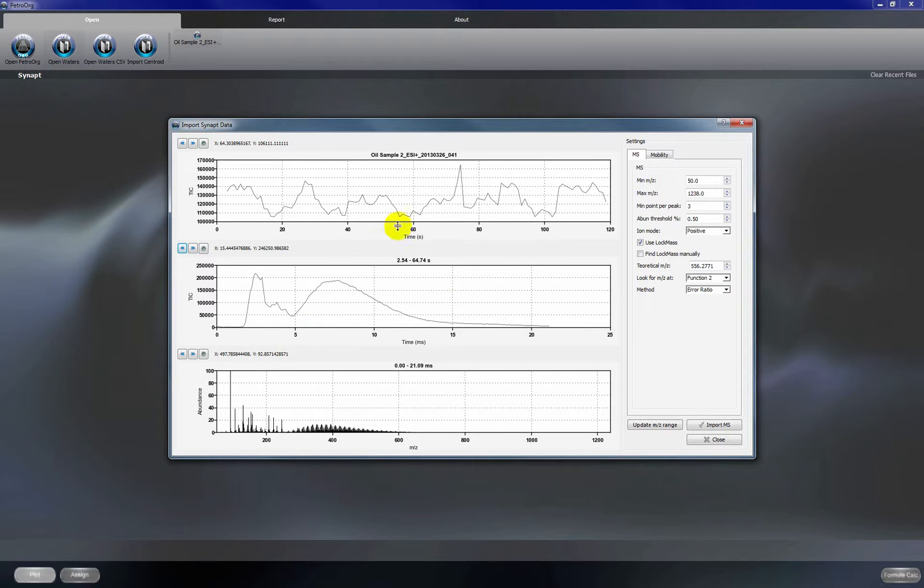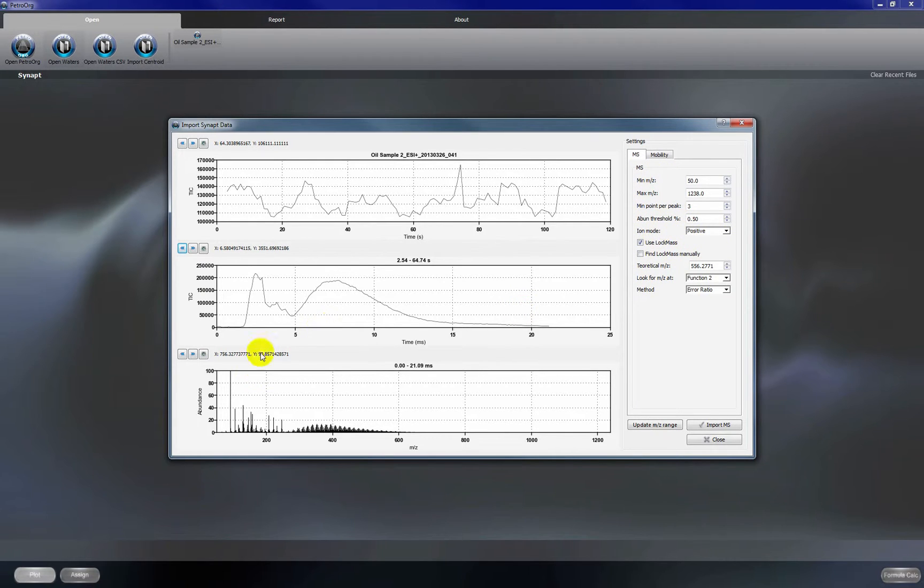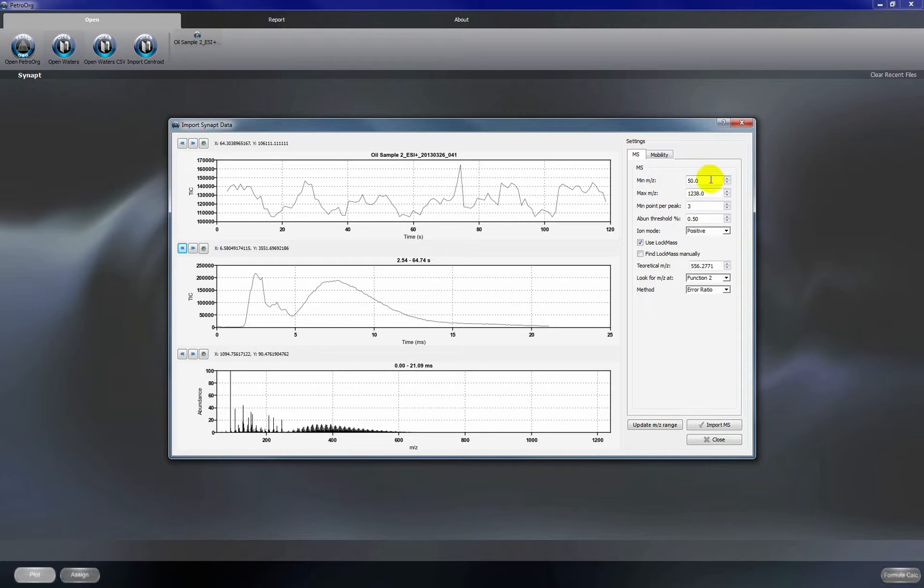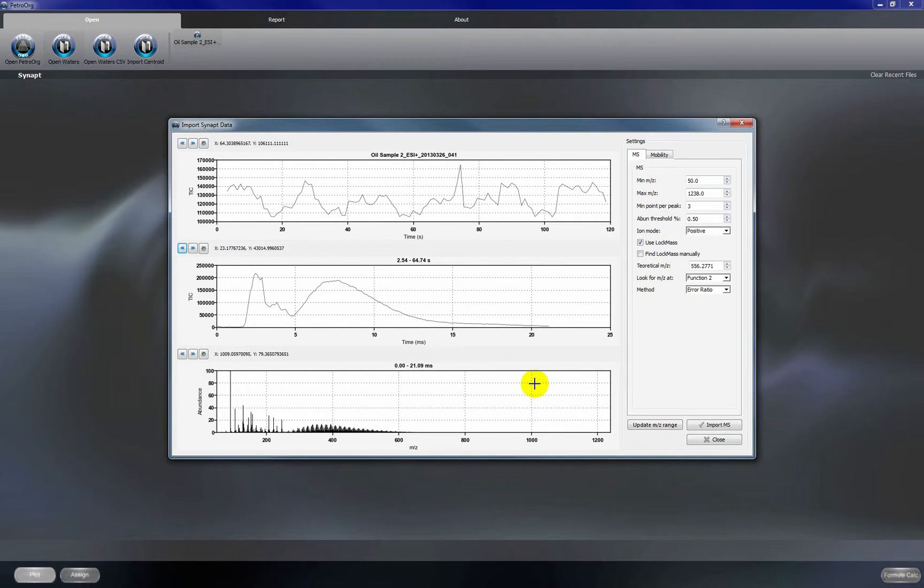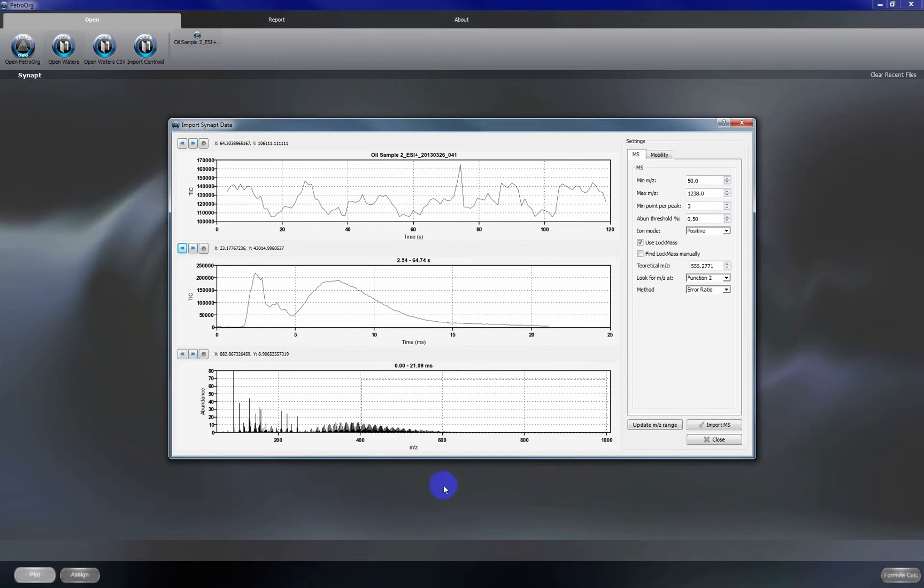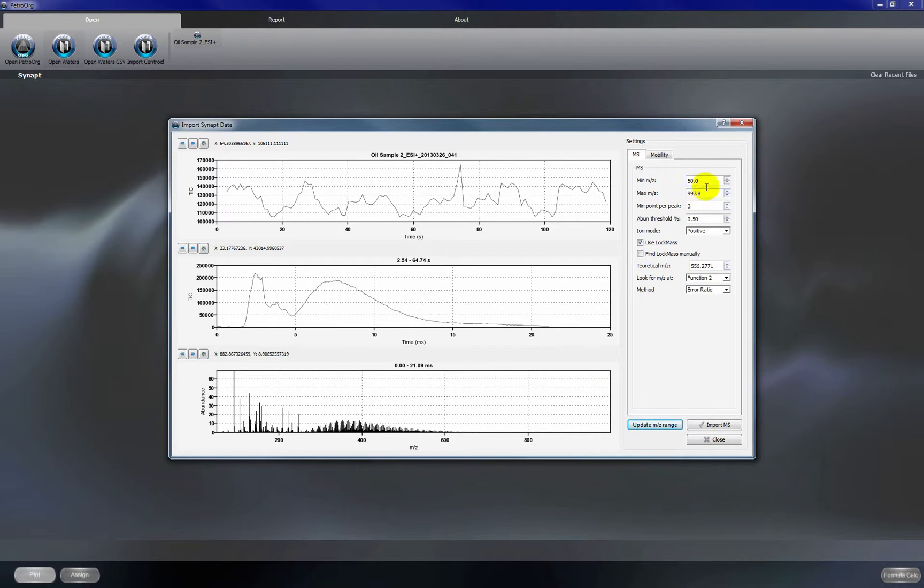Okay so the first thing we're going to do is set our instrument parameters for importing the data. So first we want to set our M over Z range. We can do this either by entering it manually in these boxes or we can zoom in to our region of interest and click update M over Z range. You can see our values have changed here.